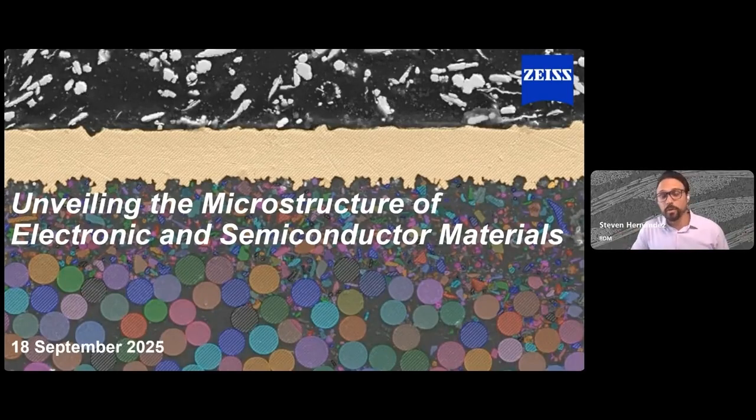So speaking of the topic, what are we going to be talking about? Well, we're going to be talking about the characterization of the microstructure of electronic and semiconductor materials.